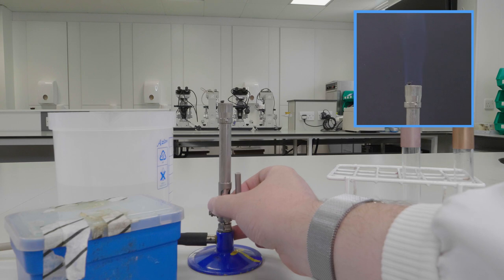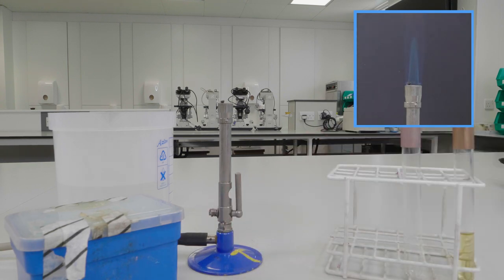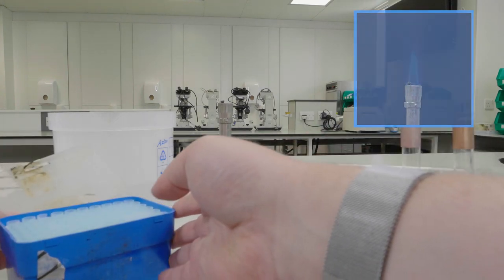Let's get working. Turn on your Bunsen to the blue flame and place a pipette tip on the end of your pipette.